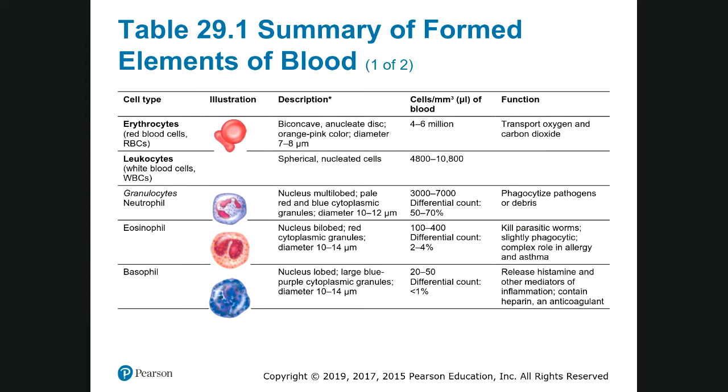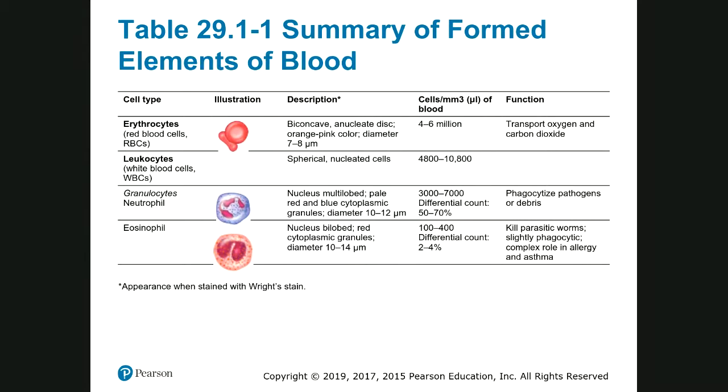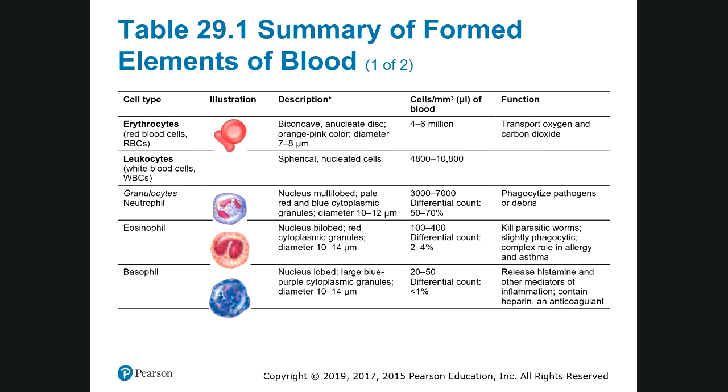So the granulated ones, or the granulocyte cells, we have the neutrophil. Here is the thing.